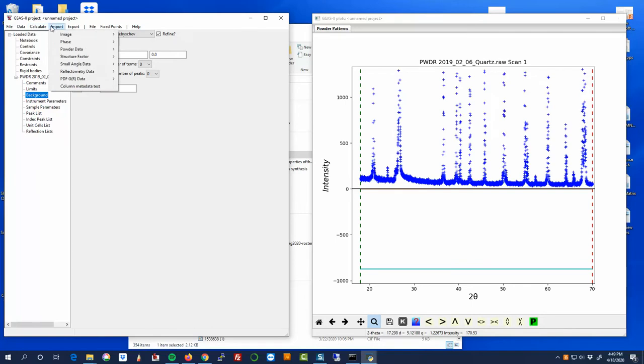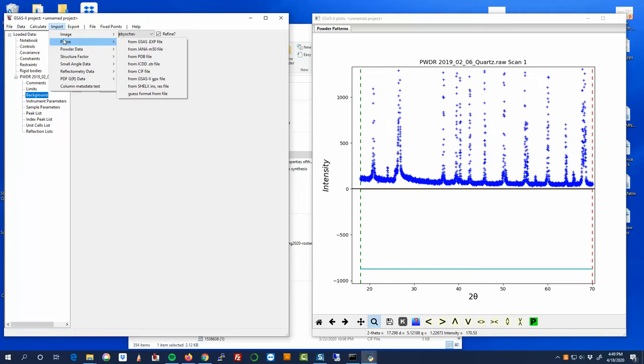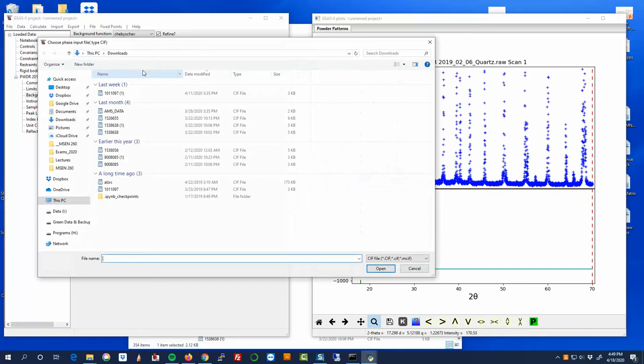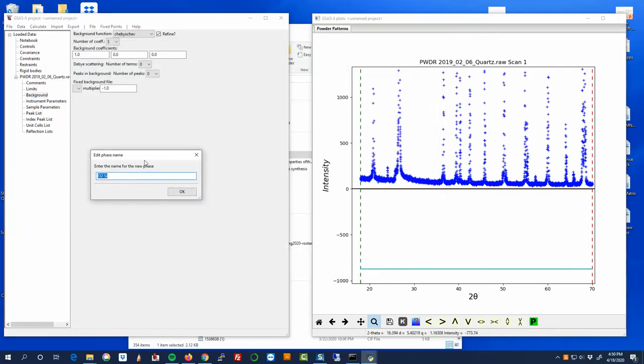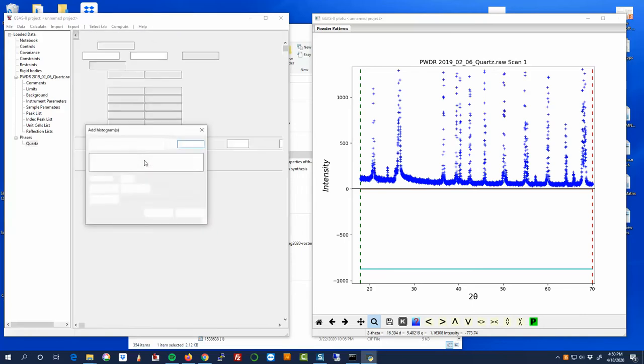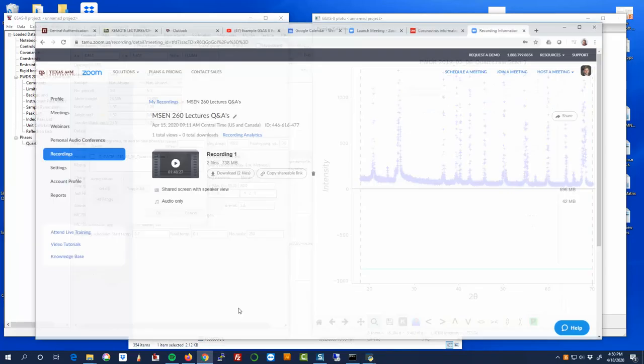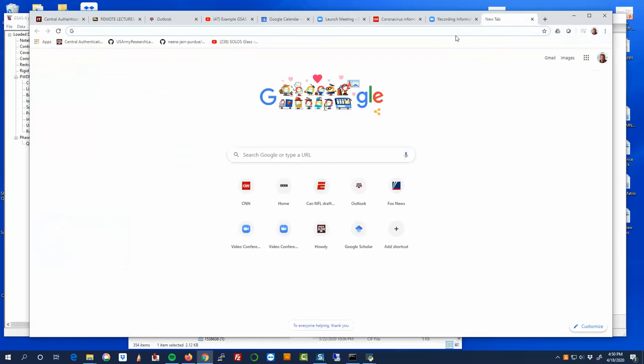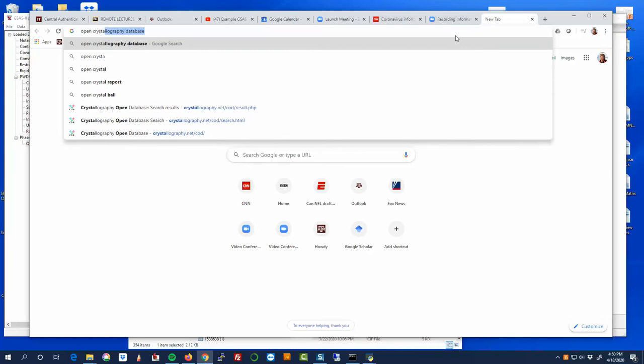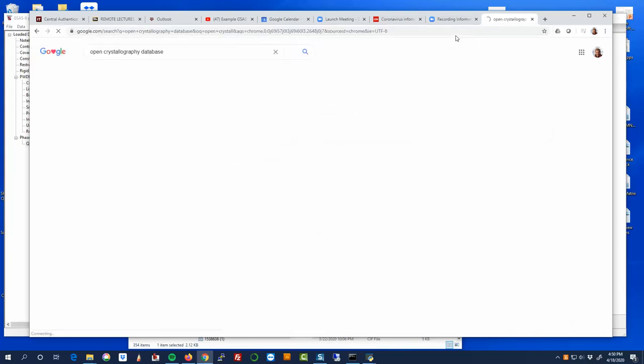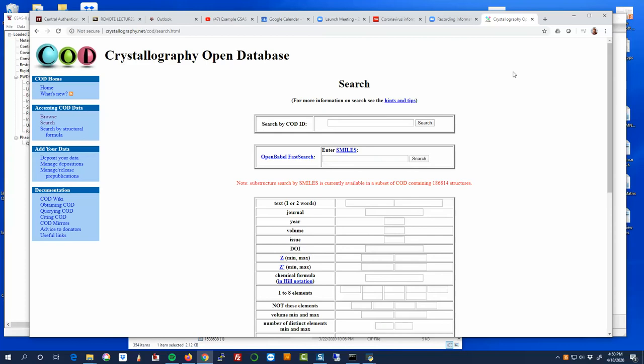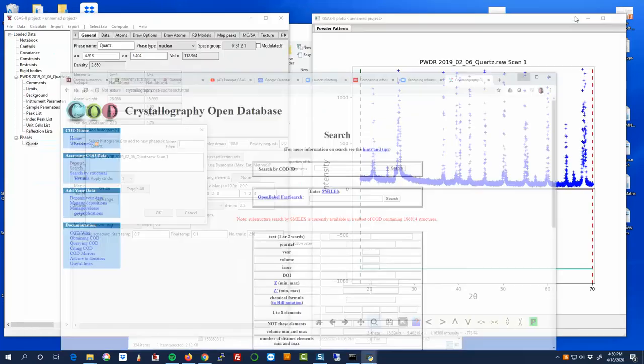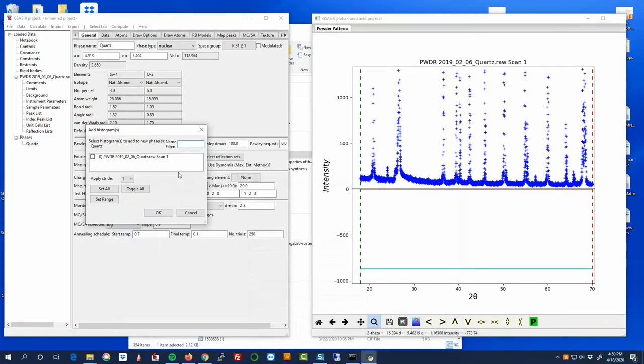And so right now it sees our raw data, but it doesn't know anything about the starting point of the refinement. And so I'm going to import a phase from a CIF file. And again, this is the CIF file for quartz. And do I want to read this file? Yes, I do. And I'll go ahead and rename that to be quartz. So just as a side note, if you ever are looking for a CIF file, you can go to open crystallography database, which is at crystallography.net, and you can search for a particular compound. And these are all open source, so anybody can easily access them. And that's where this starting guess is from as well.